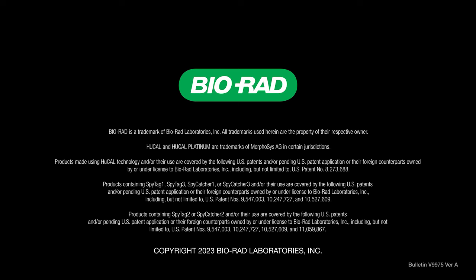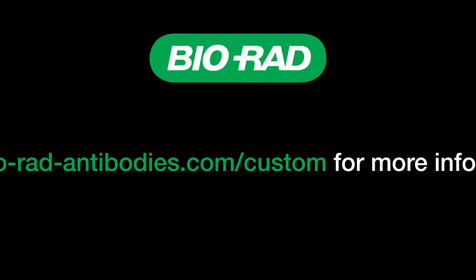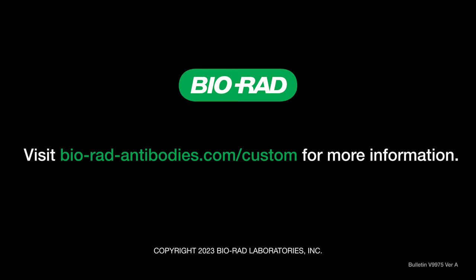Okay, we have one question that's come in, which is, what type of antigens can you work with, and are there any types of antigens that you can't work with? Hi, Paul. Thanks for the question. The answer to this is that we can work with a really wide range of antigens. This can range from proteins to DNA, peptides, small molecules. We can actually also work with toxins. For example, we've done projects against ADC payloads, as well as attenuated viruses.